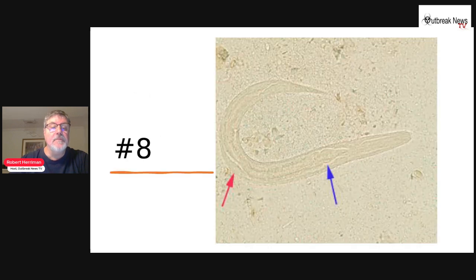Next one. Maybe a little hard to see because it's faint, but let me give you a description in number 8. This stage of the parasite is 180 to 380 microns long, with a short buccal canal, an esophagus that's divided in 3 sections, extending 1/3 of the body length, and a prominent genital primordium. A few seconds.